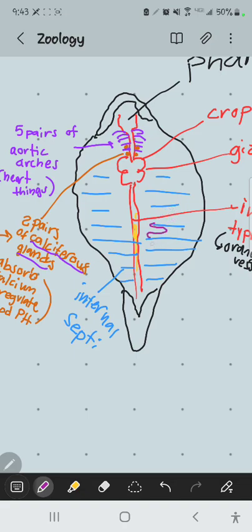So these are nephridia. I won't ask nephridia on the test because it's super hard to get them reliably seen or exposed, and it's certainly really hard to put a pin in them so I can ask you questions about them.